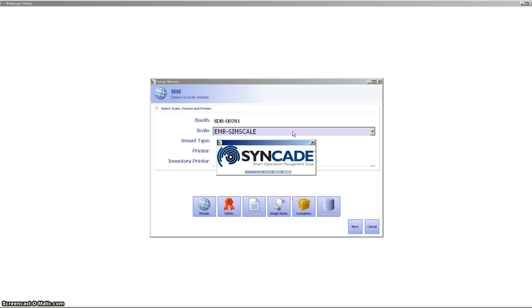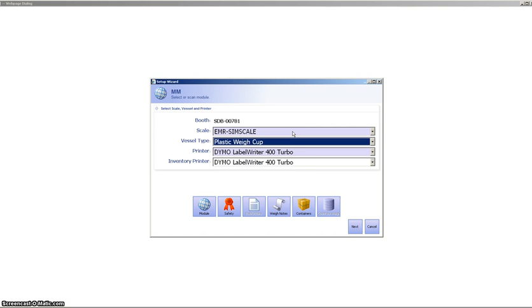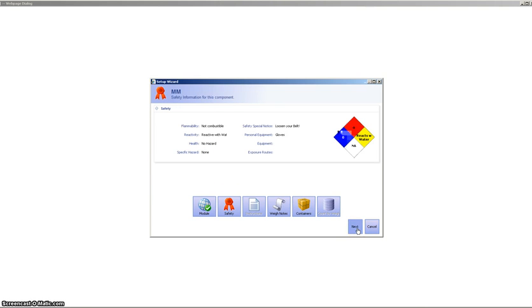Once that test comes back, we can then determine what we're going to dispense into. We're just doing M&Ms here, so a little plastic container will be fine. We pick our printer, and then we hit next. Now, the wizard walks us through the key pieces of information that are required for the operator.